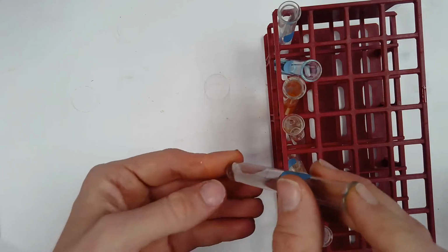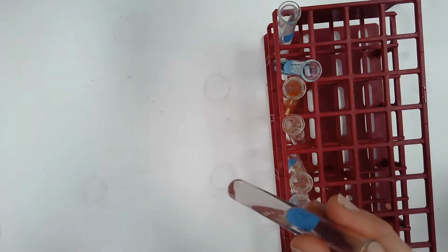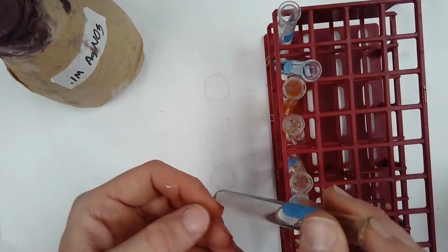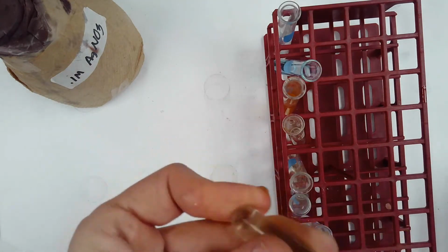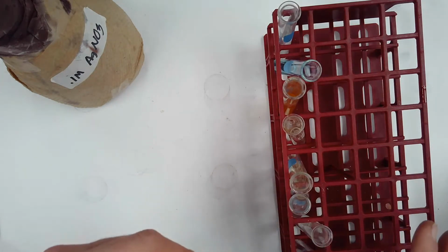Now, I did something I should never really do, which is I took chemicals that I had poured out and returned them back to my stock container. That's a big no-no. But I did it because it's valuable, and I just cleaned these test tubes. I know that for a fact they're clean, right? I know there's no contamination. Still shouldn't really do that in a lab.